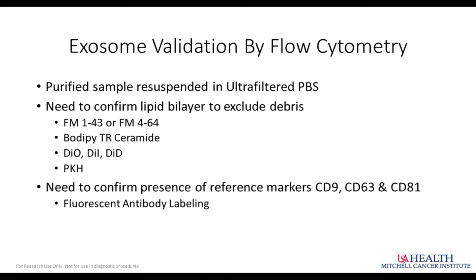One thing I just realized I forgot to tell you is that the FM1-43 is excited by a 488 nanometer laser, and it emits its light in the 525 to about 625 nanometer range, fits into the PE area.